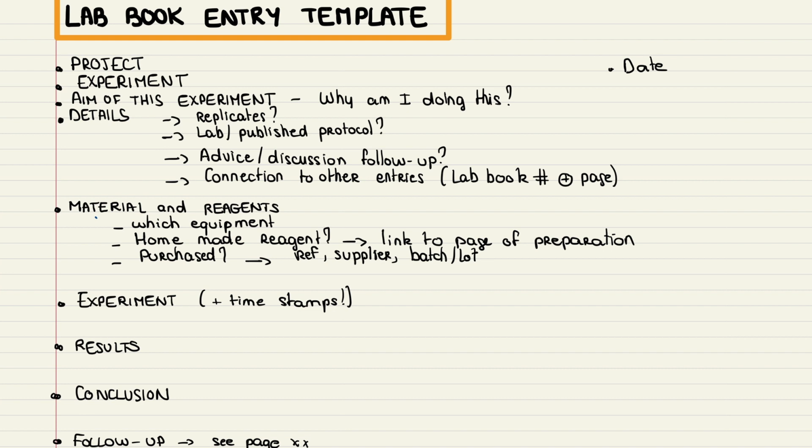Tip number 5. Use a consistent structure for each experiment. This will make it easier to navigate through different experiments within the same lab, as each component will be mirrored in the other experiments. Tip number 6. Document every action that you take. And if you change your plans, take notes accordingly, including any change to material or quantities.